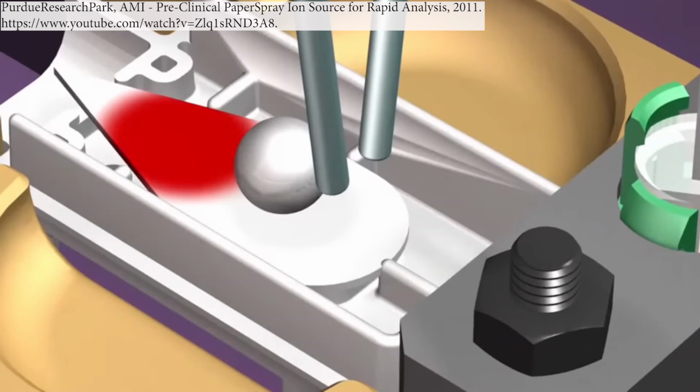The DEA has used DESI. A bunch of labs have used DART. Paper spray, the Dutch Forensics Laboratory, the Dutch National Forensics Laboratory, the Netherlands Forensics Institute, has tried paper spray, and they've gotten very close. But this method holds a lot of promise, particularly in toxicology and in swabs for trace residue. So this is looking toward the future. I think it's going to be important in the future.